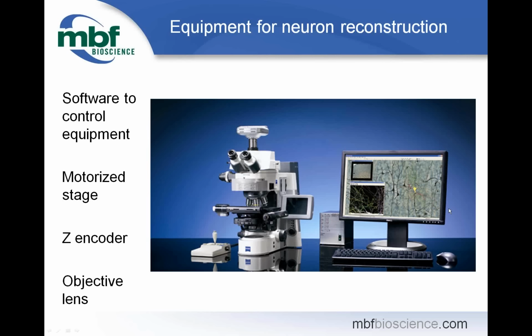The increased workspace afforded by the second monitor allows you to keep software features that increase your efficiency available during the reconstruction. Due to the webinar format, the demonstration today will only use one monitor. Finally, you need to use objective lenses that provide the needed resolution and depth of field. Kohler illumination should be achieved prior to beginning your reconstruction, since it will optimize optical resolution and decrease eye strain. This is, of course, not necessary for fluorescently labeled tissue.